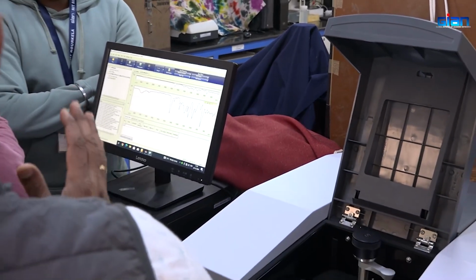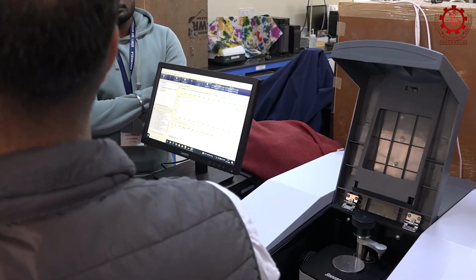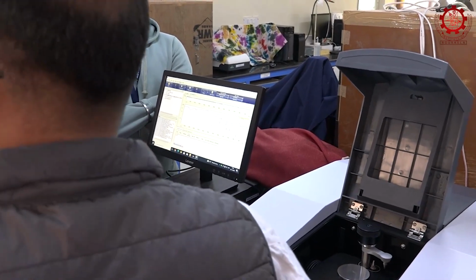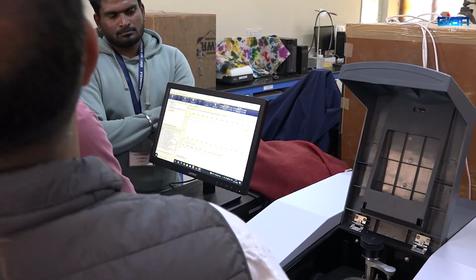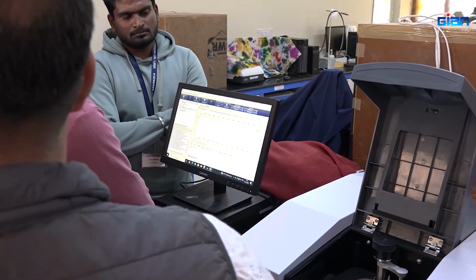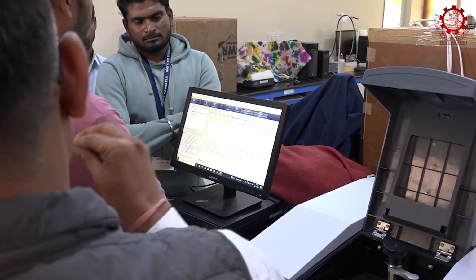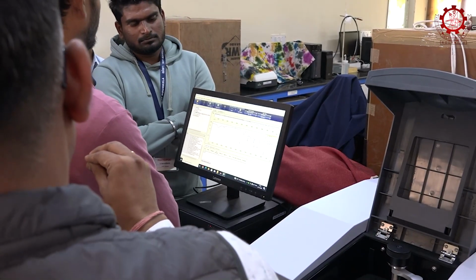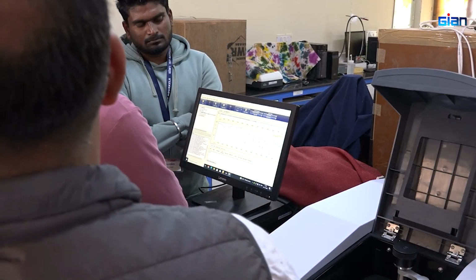Okay. So now we have the information on what wavelength and what intensity we have given from the source. Now we put our molecule in between. When we put our molecule, this electromagnetic radiation and the molecule will interact.